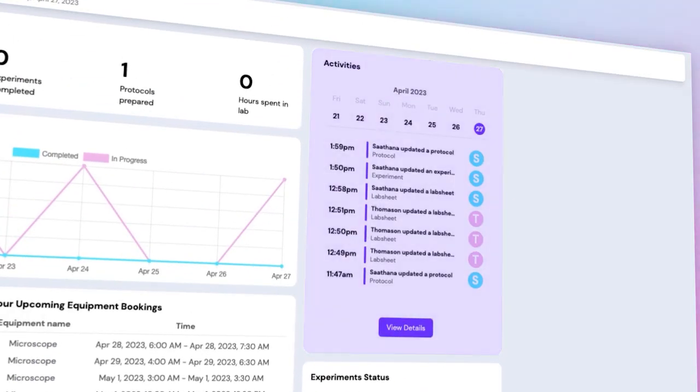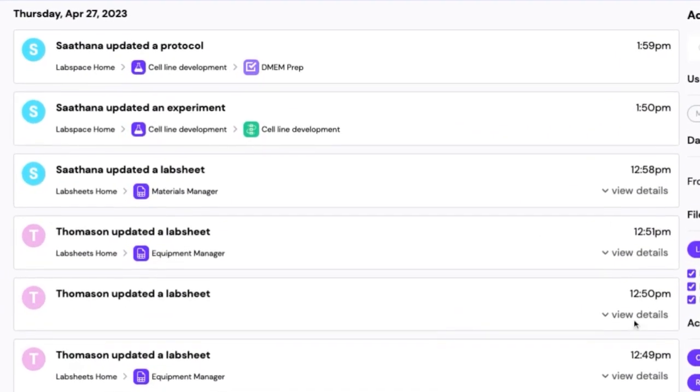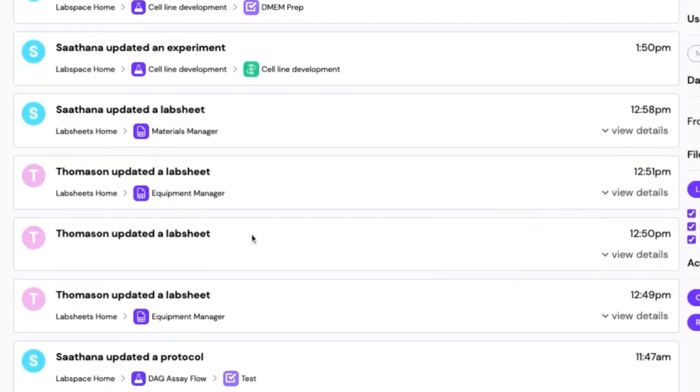Here, under Activities, you can see an audit trail of all actions that have taken place in your account.